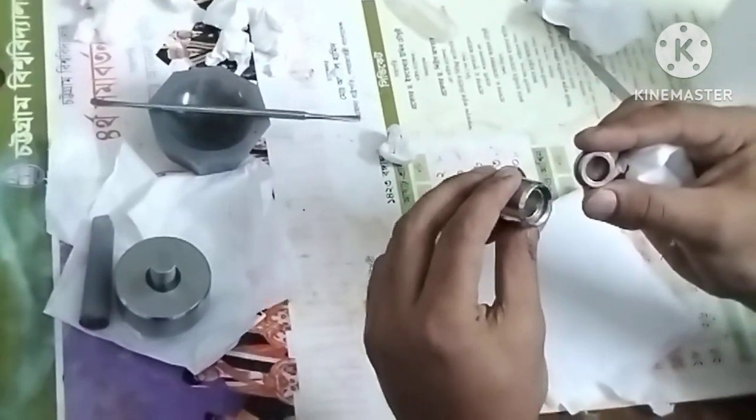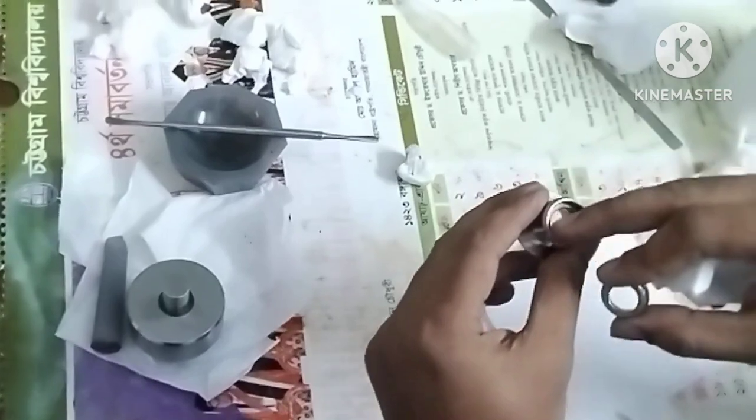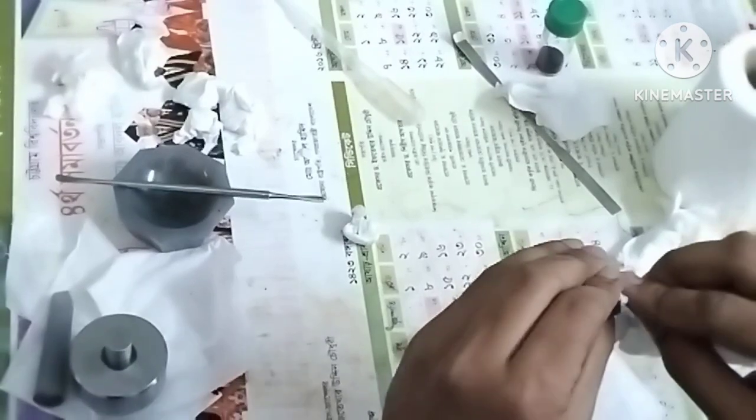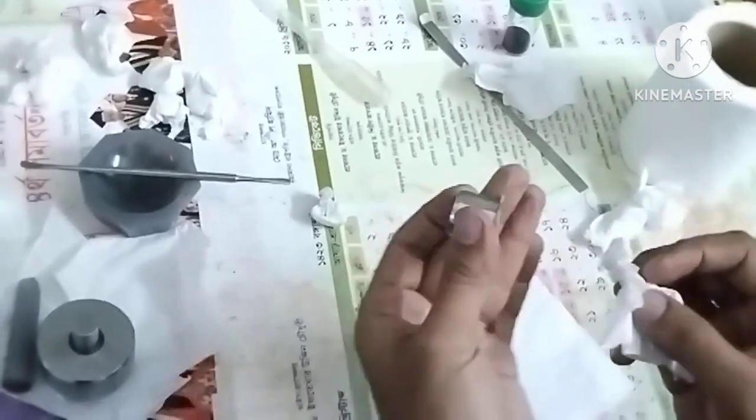We will put this machinery on the table, and we are cleaning this FTIR cell, and we will press the KBr plate into this portion. Then we will use the small ring for properly placing the KBr plate.